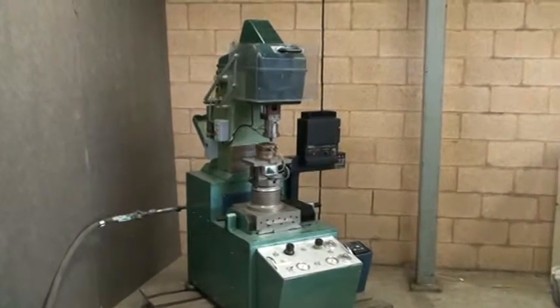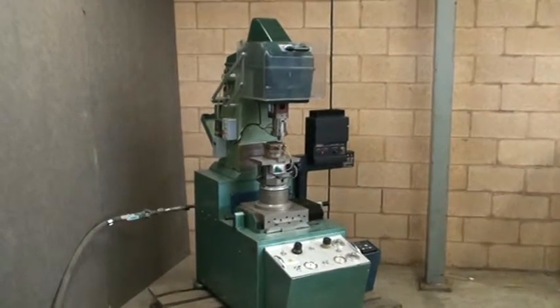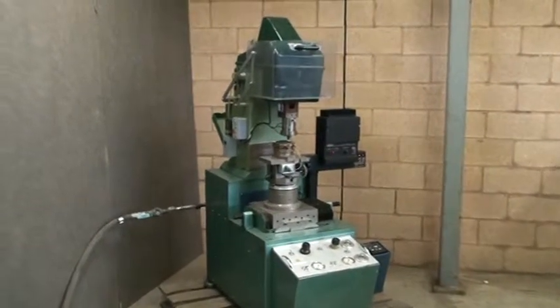Alright, here we have a specialized elastomer test machine. This machine was developed for the US Army and Navy for testing rubber samples.